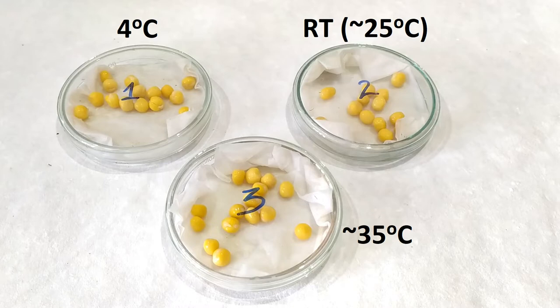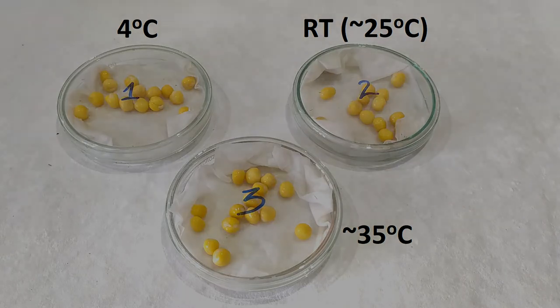Leave the plates in these temperature conditions for a few days. After a few days' time, observe the plates to check for signs of germination or the lack thereof.